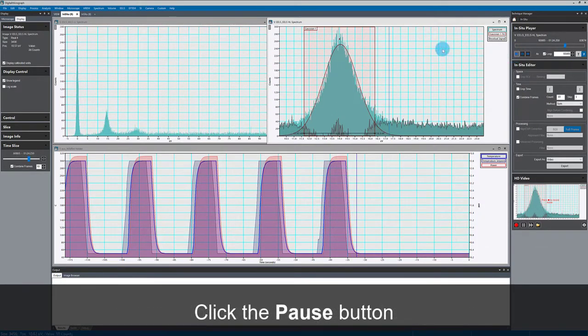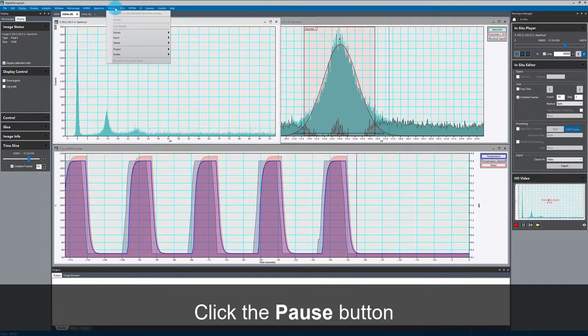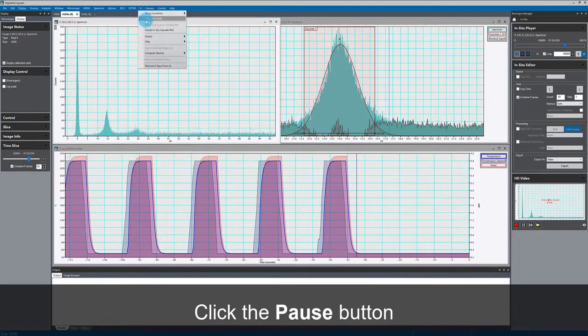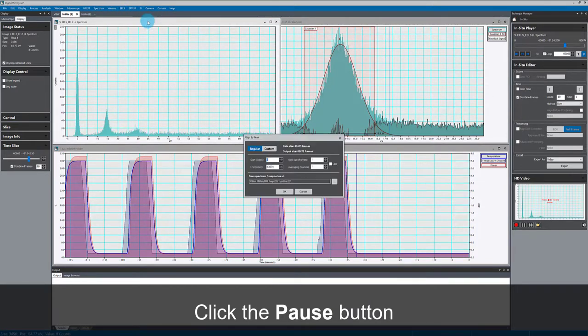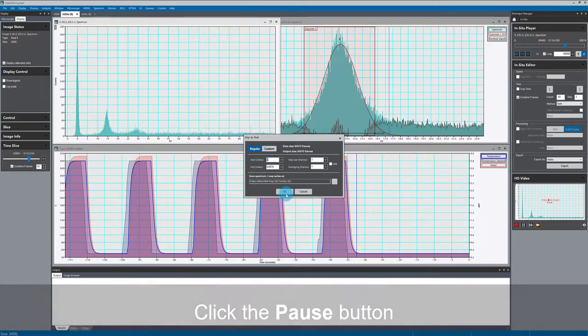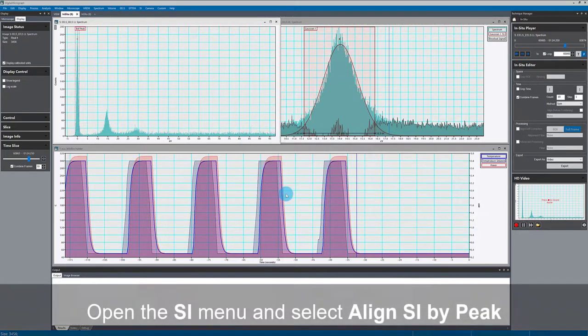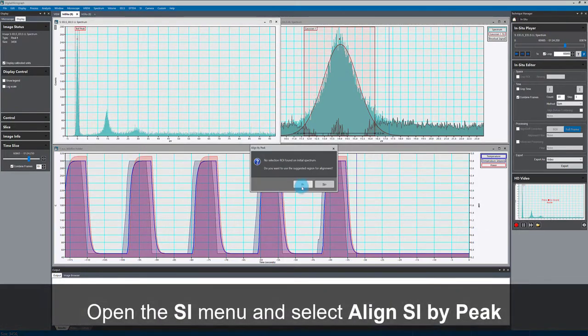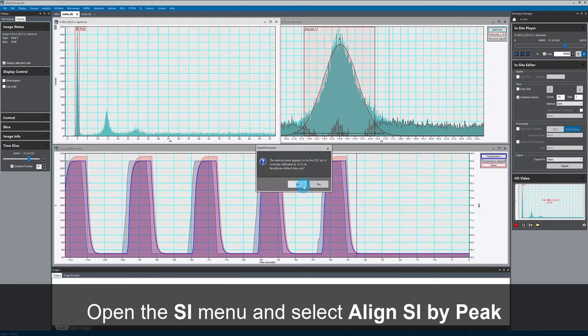Now, I'm going to align my data using the zero loss peak. It's very important if I want to accurately measure this plasmon peak position for my zero loss peak to be at exactly zero throughout the dataset.